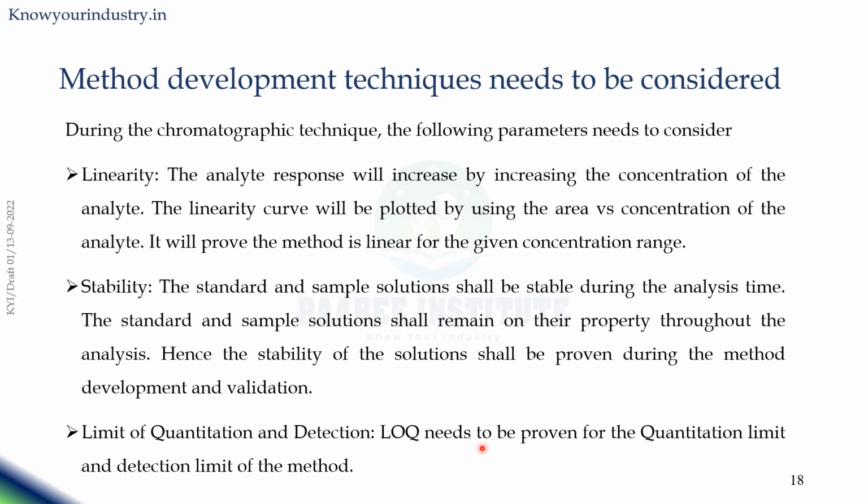And the detection limit is the minimum concentration you can detect, not quantify. Just detect. That is LOD, limit of detection. And the concentration at which you can quantify properly, which is part of the linearity also, is called the limit of quantification.